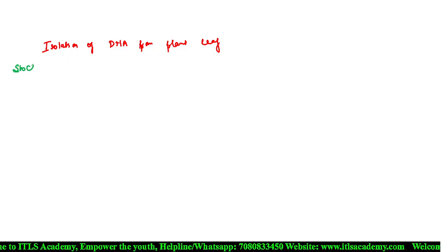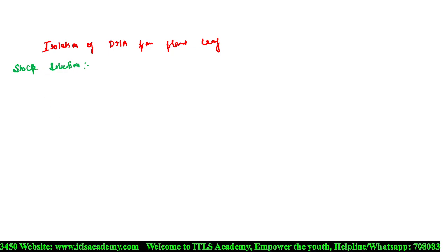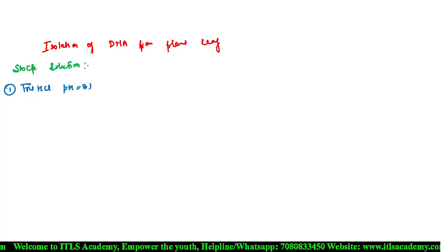So do you know what a stock solution is? Yes, ma'am. What is the stock solution? It's a high concentration solution. So the stock solutions that we have to prepare here: first is Tris-HCl, whose pH will be 8 and concentration is 1 molar.